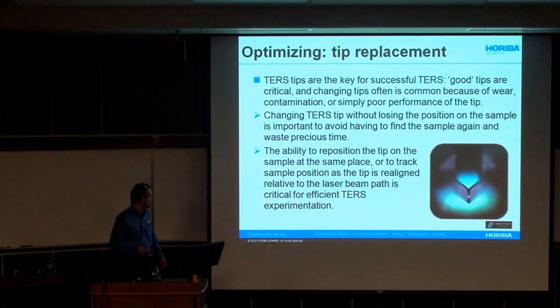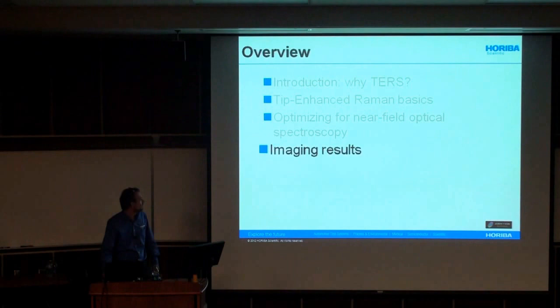Also, being able to track the sample as you move the tip back into the laser beam is a way to keep track of where you were on the sample. So these are more process methods, but that's important to not waste time looking for the sample again. So a few results to finish.